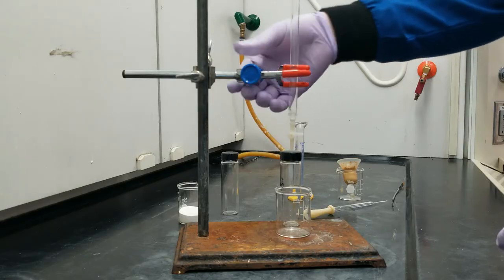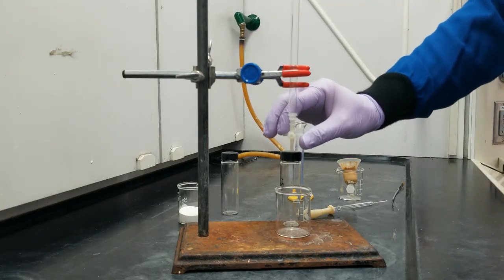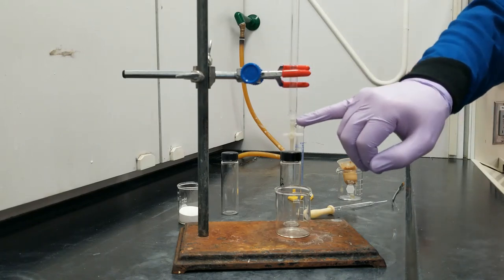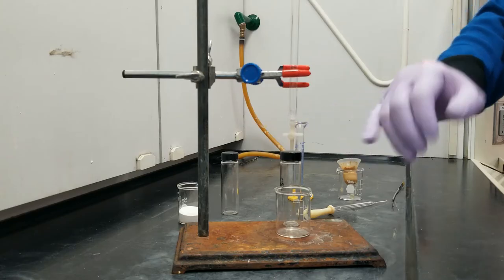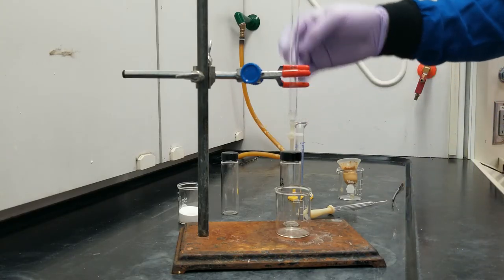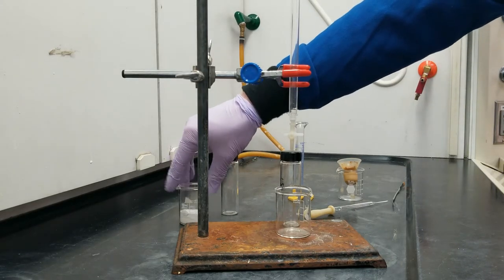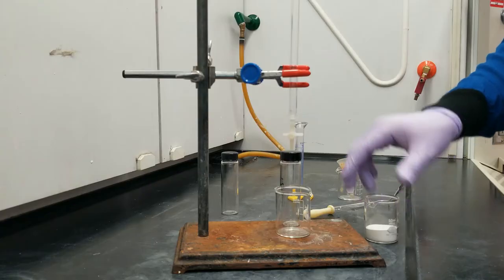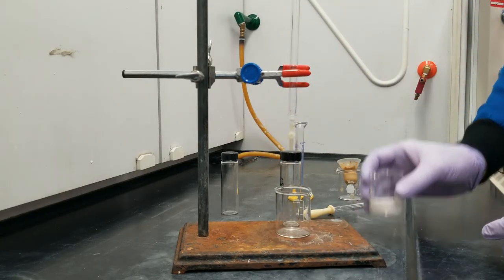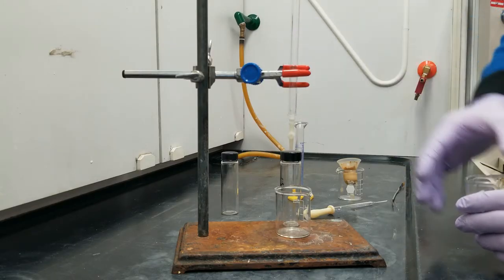So, here is our column. We've got a stopcock down here. This is a luer tip, which has a little filter in it, very much like a vacuum filtration, and the column where all of the alumina is going to go. So the first thing I'm going to do is I'm going to open this up and introduce my alumina, and I'm going to fill this up about two-thirds of the way.